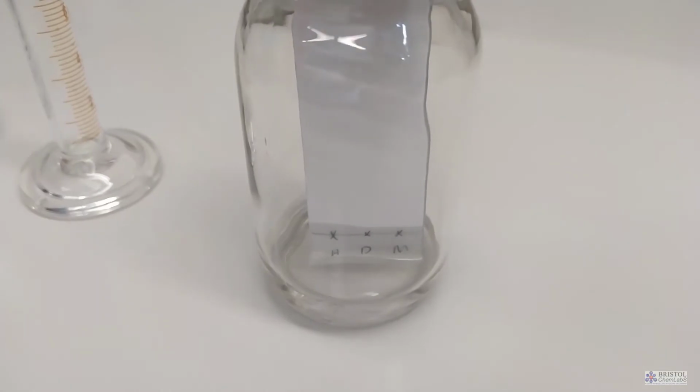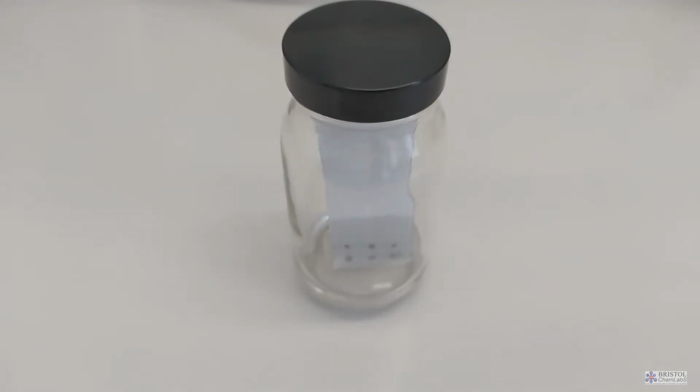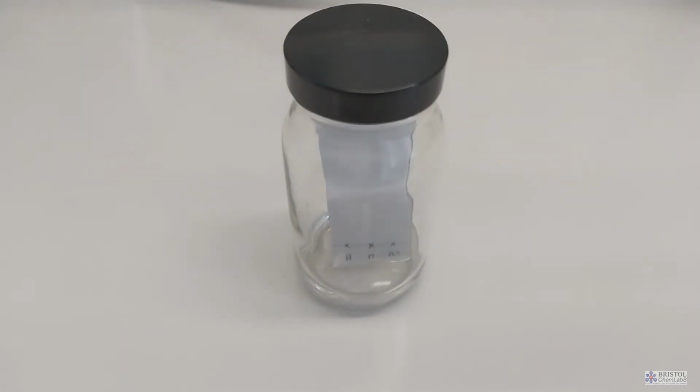As soon as the solvent front gets near to the top of the plate, we unscrew the jar, take out our sample and immediately mark the position of the solvent front. If you wait more than a few seconds, it will start evaporating and you won't know exactly where the solvent has got to. We would need to know where the solvent has got to if we were making calculations of Rf values.